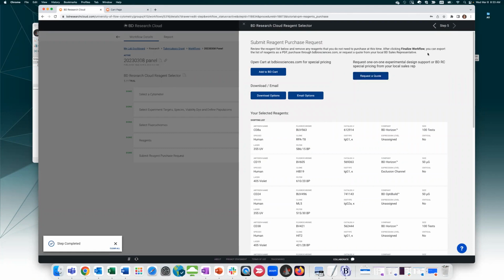BDRC knows your location based on your sign-in, so by requesting a quote, it'll just send the email to the right person at BD. Any questions about panel creation?